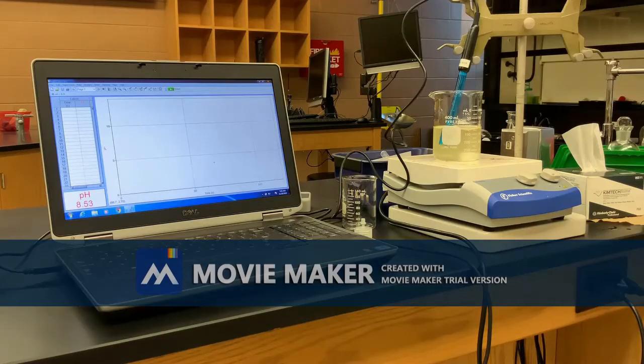And now, very strangely, after adding acid, now I'm seeing only pretty high pH values. So again, it's very difficult for us to guess where our starting pH was. We just had to go out on a limb and guess. Now I'm not seeing any 6s or 7s. I'm only seeing 8s and 9s, and I've added acid, which I should be seeing it go down. So therefore, very hard to know what our starting pH was. Just very difficult to tell.